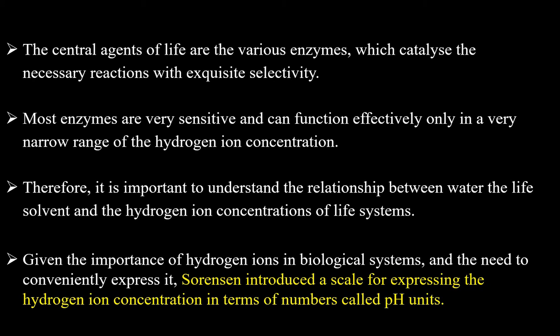or the enzyme assay, because the particular pH which is known as optimum pH for that enzyme activity and other pH may not be the same, and that may cause changes in the protein structure of the enzyme, and it affects the catalytic activity by causing denaturation of the enzyme.